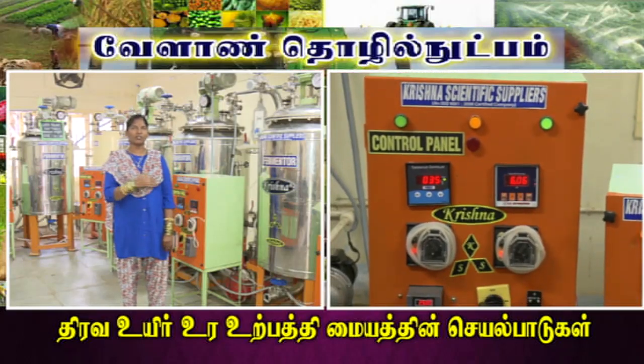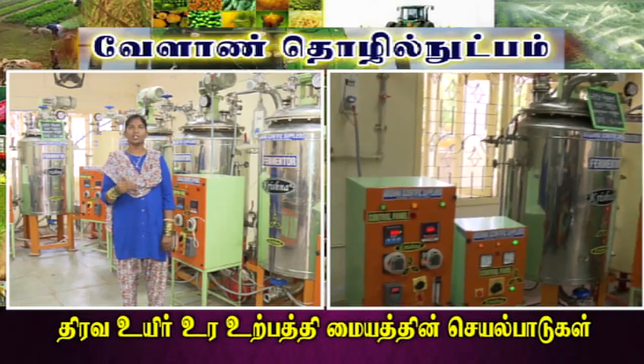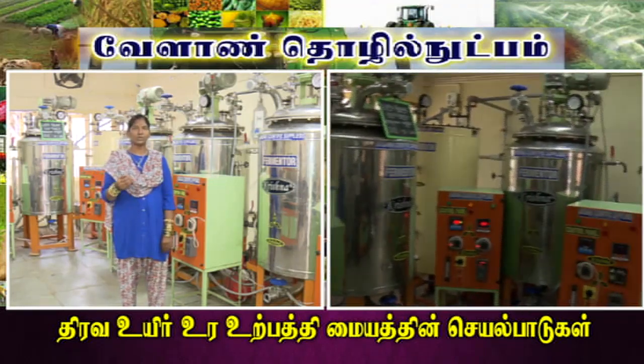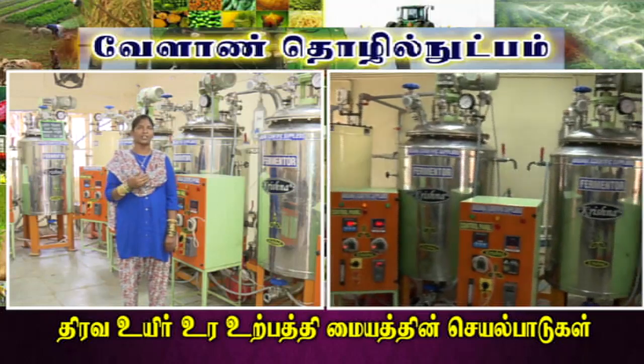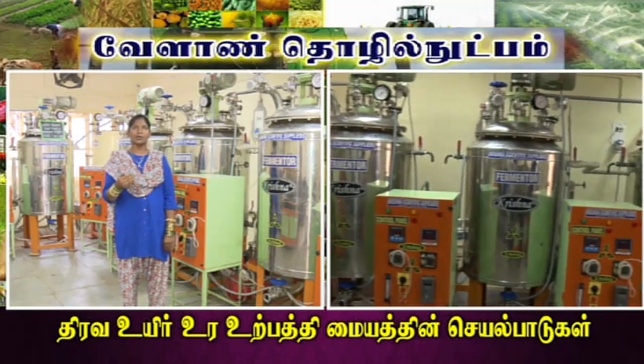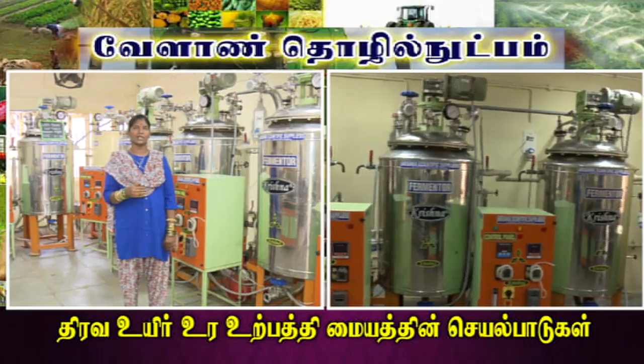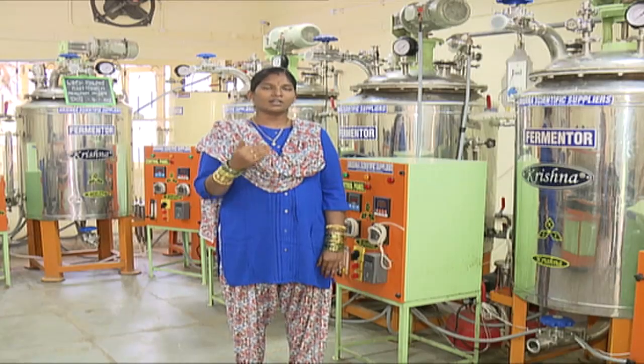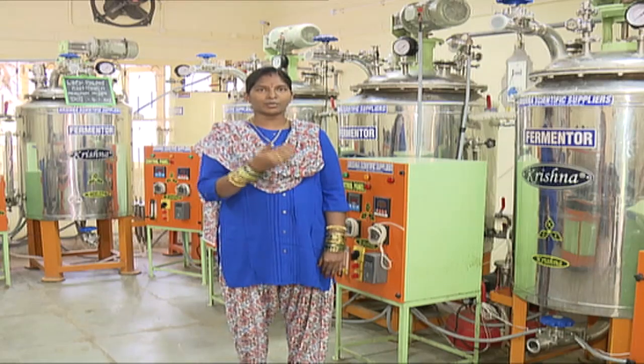We go from bottle culture to the fermenter. The fermenter is for large-scale production, whereas for conical flask culture we produce 250 ml. For a fermenter, we produce 200 liters. In the fermenter, media is made ready at 120 degrees Celsius temperature.